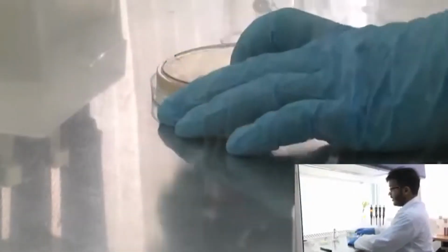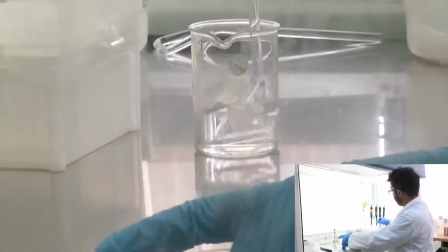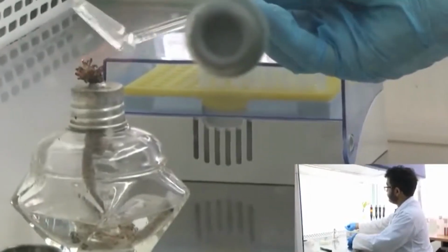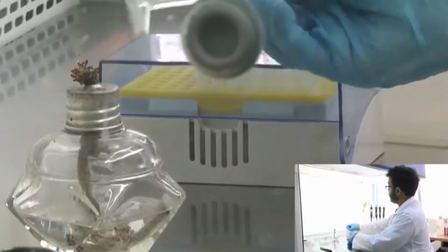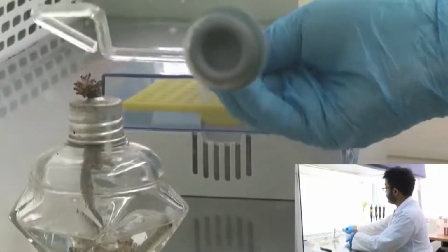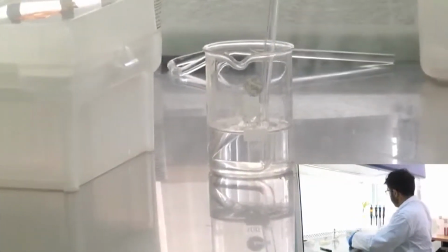So next we are going to plate 20 microliters of the culture. My spreader is already in ethanol. Again, I use this for spreading the 200 microliters, but after that I put it in ethanol, and let me just get rid of the ethanol, burn it off in the burner. So I do it twice. I dip it in ethanol once, thoroughly get it sterilized with 70% ethanol, then I heat it in the burner flame to get rid of the ethanol, and then I again dip it in ethanol and repeat that. So I just do it twice.